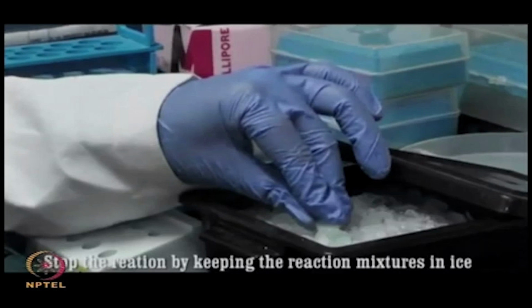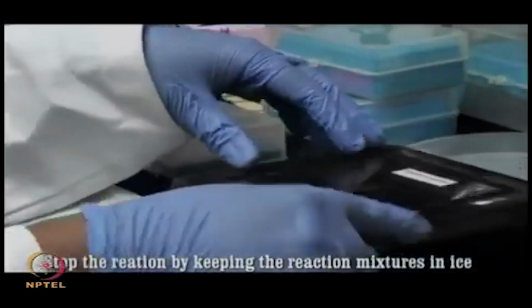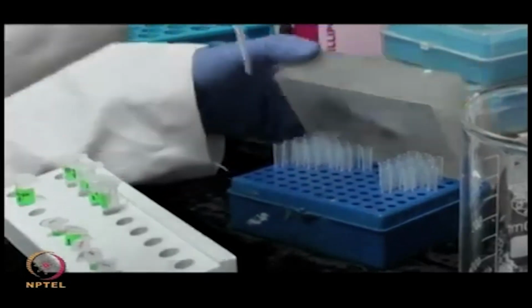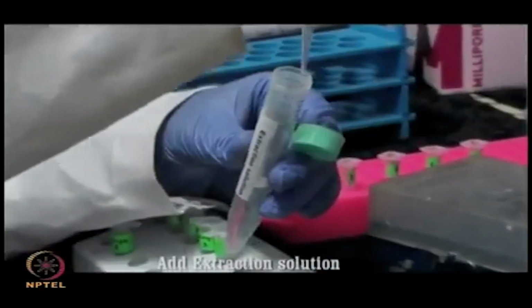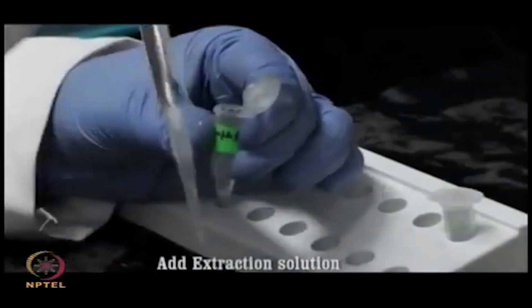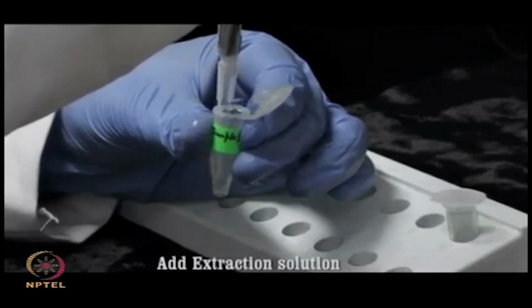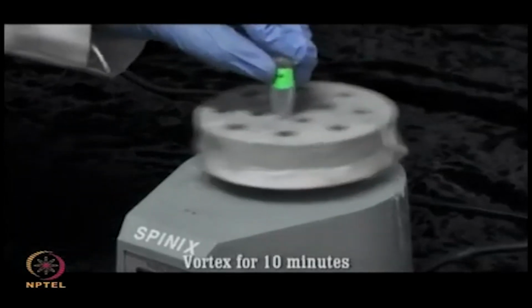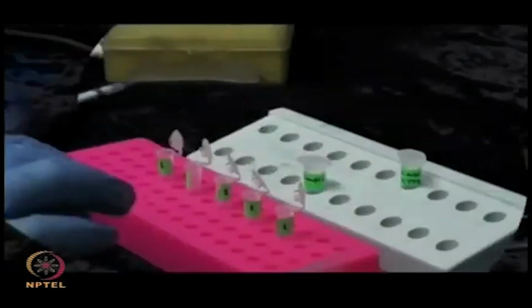After the overnight step, you have to stop the reaction by keeping the reaction mixture in ice. Now, after the overnight incubation, the peptides generated through the proteolytic digestion can be extracted by using extraction buffer containing 0.1% formic acid or trifluoroacetic acid in 50% acetonitrile solution.